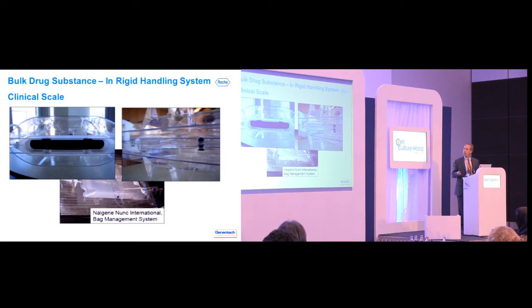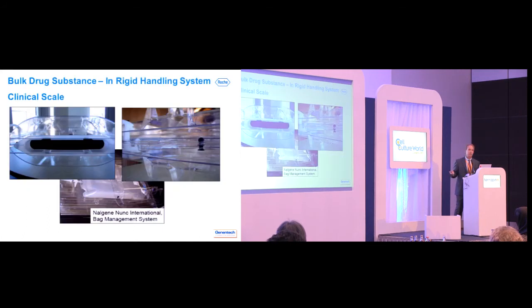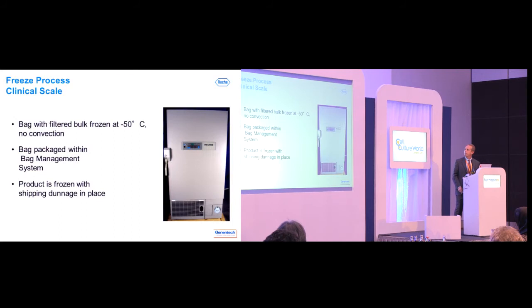So we basically manufacture all of our clinical scale phase 1, 2 materials in these, and we have designed a system with Thermo that does a controlled rate freeze through Delta V, controls the freezer, and also does building management system and looks at the rate of your freezing, so we don't have to use these stainless steel tanks anymore. Well, that's only good to a certain level. So if you start freezing 300 liters at a time, you're not going to want to be filling 15, 20 liter bags.